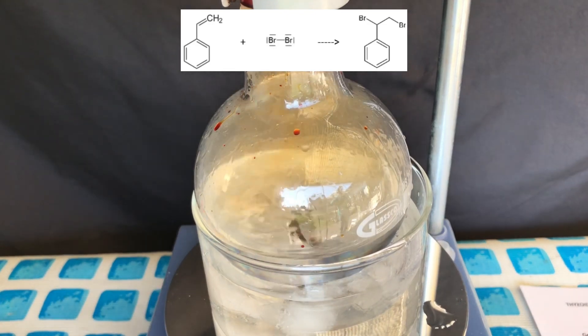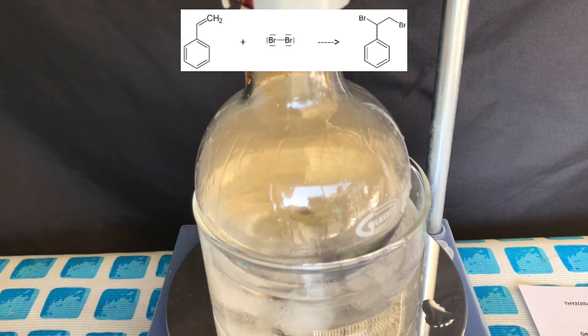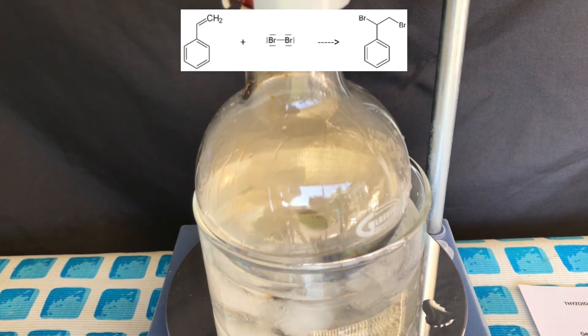This is because an addition reaction between the bromine and the double bond is taking place. No nasty byproduct is formed, but only our 1,2-dibromo-1-phenyl-ethane.